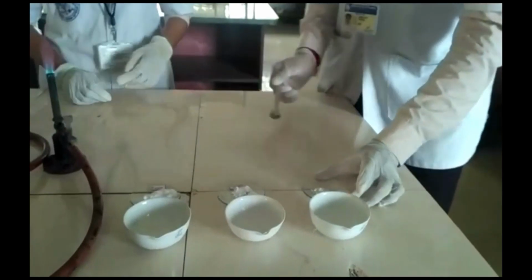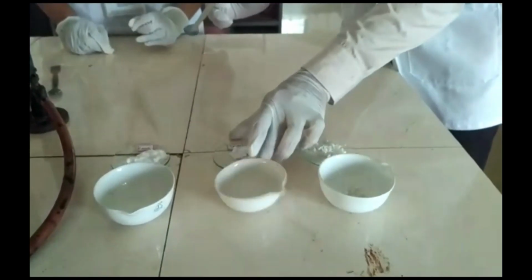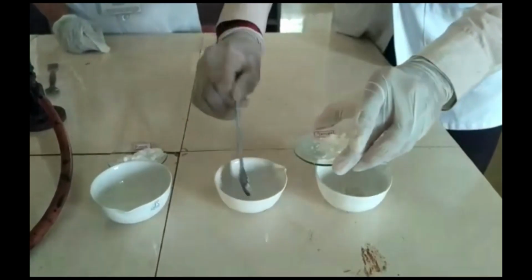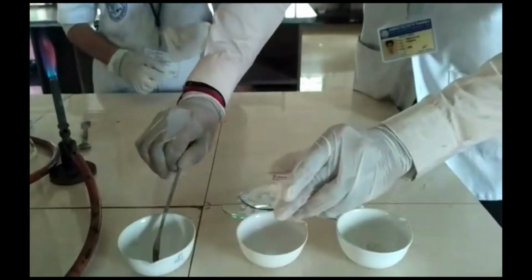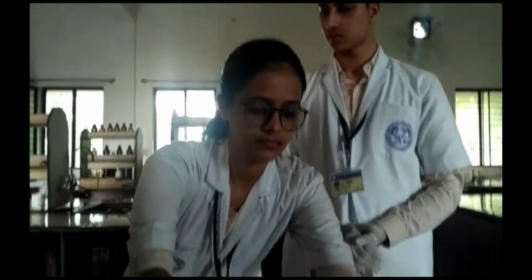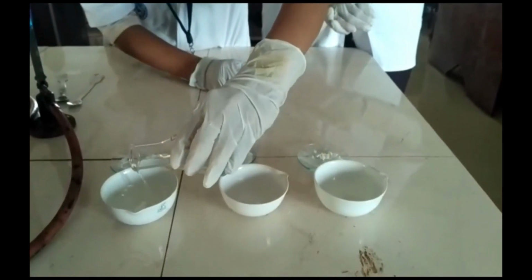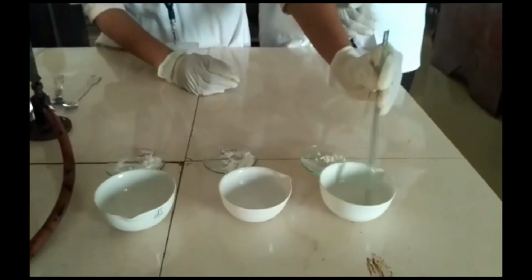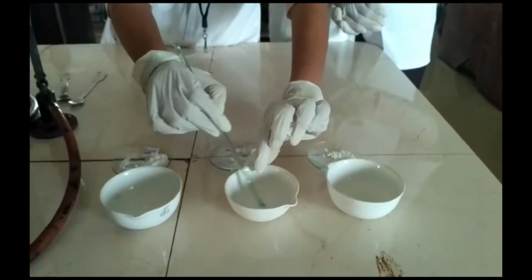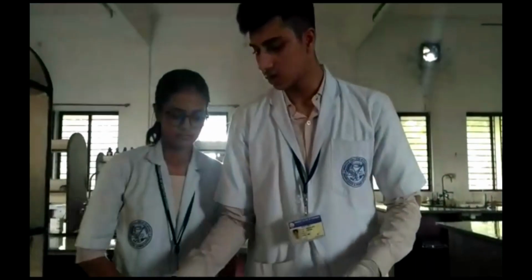Now I am going to add each chemical to the china dish. So this is calcium chloride. This is aluminum hydroxide. And this is borax. Using glass rod. So now I'm going to light each of the china dishes.